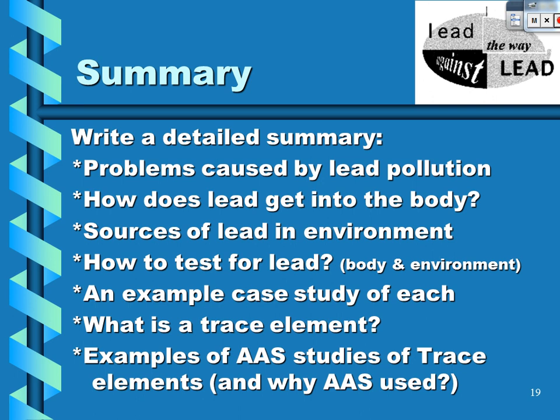Finally, what's a trace element? And some examples of AAS studies of trace elements. And why do they use AAS? So why do they need to use AAS to test those soils? Mainly because trace elements have impacts in such low concentrations that AAS was the only technique sensitive enough to measure those trace elements.